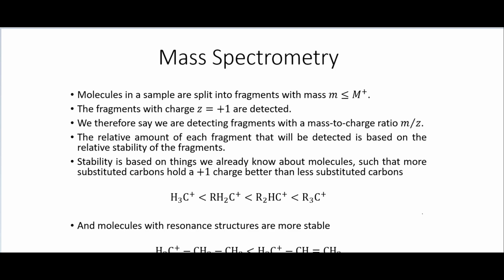Seeing things like the alcohol stretch or the carboxylic acid stretch, those can become fairly easy to interpret.